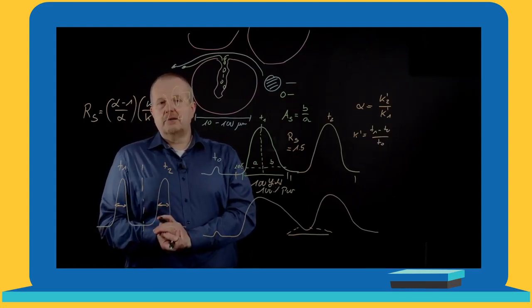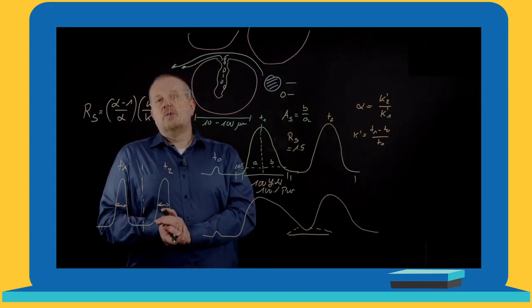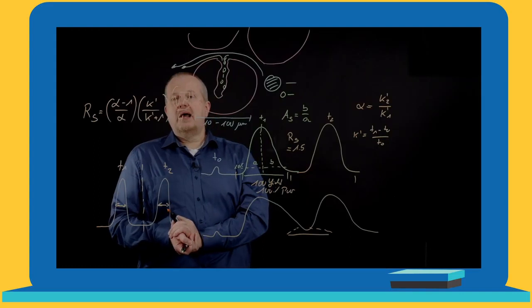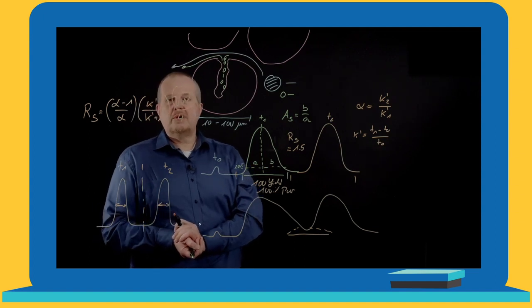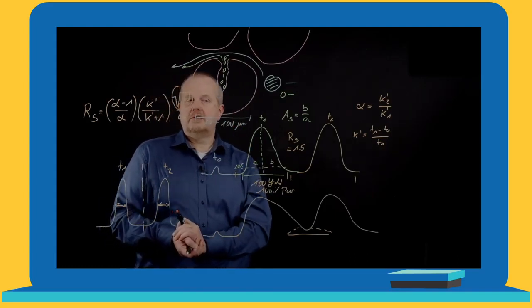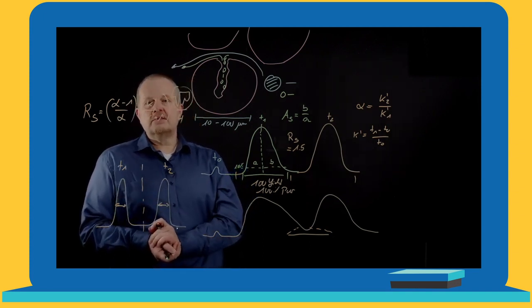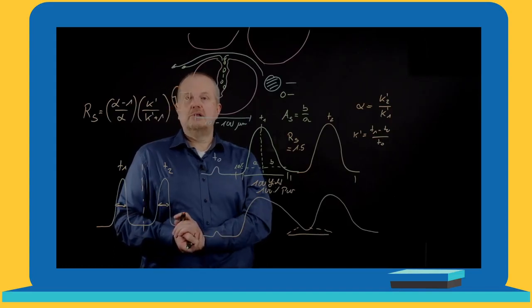First of all, we pack our column as carefully as possible. Second, we take a sorbent which has a very limited distribution of the particles. Then we need a material where adsorption and desorption take place fast. That is, for example, what we do with our tentacle technology, which we use for Fractogel and Eshmuno, where we have a very fast desorption characteristic. Last but not least, to increase efficiency, you can go to smaller particle sizes. But have in mind, the smaller your particle, the higher the pressure drop of your chromatographic column, so this has a certain limitation.